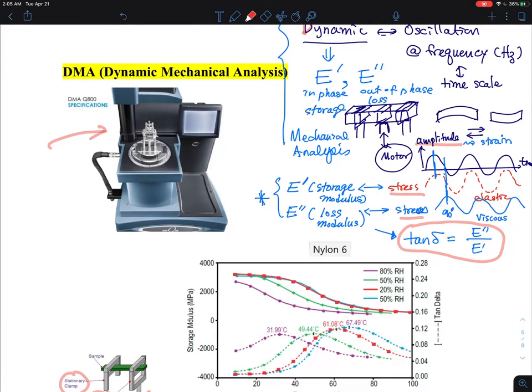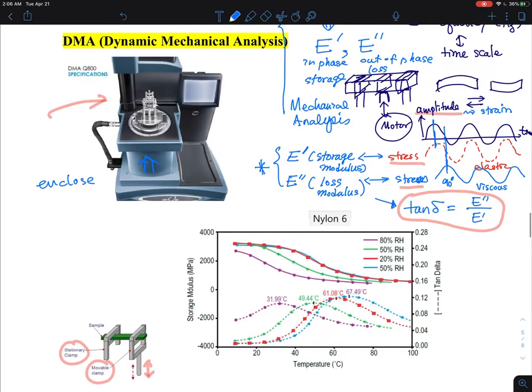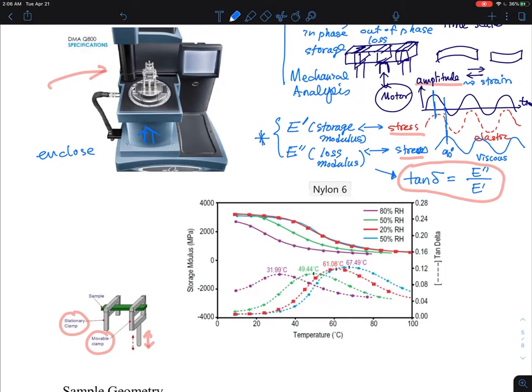The sample goes into a little chamber, which closes around it to control temperature. One thing I like about DMA is that not only can you change the temperature, but you can also change the relative humidity inside the chamber.